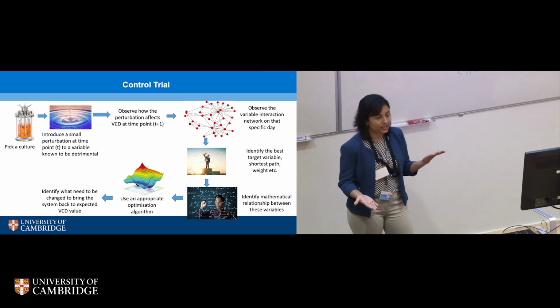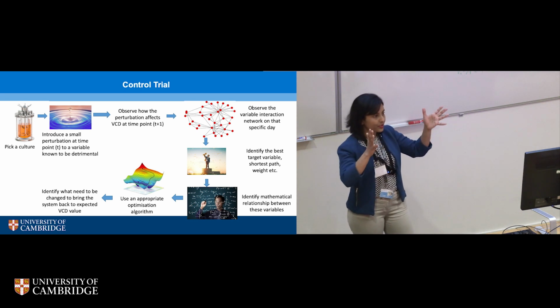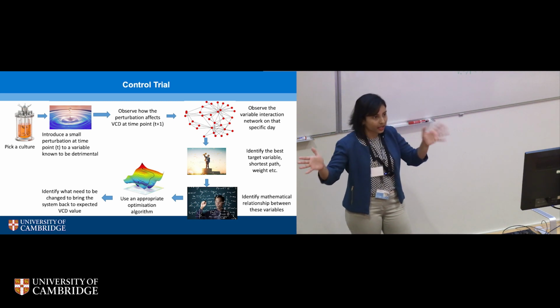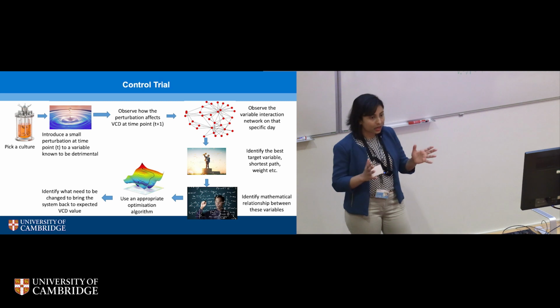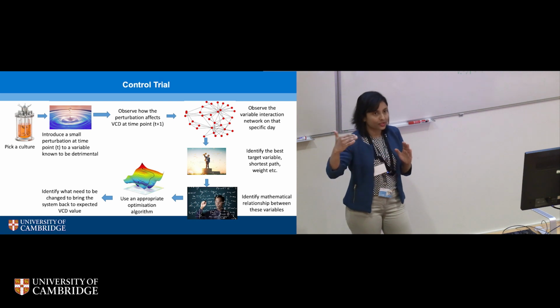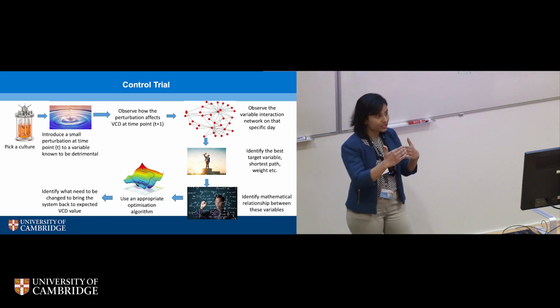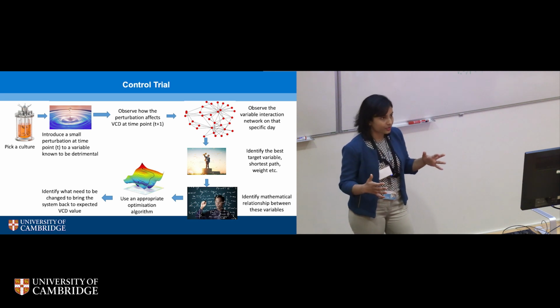And this is a powerful thing to have, because previously, all we had was a bioreactor running on its own. We didn't know what's happening. We had to wait until the harvest day to say what the outcome would be. But now we have already modeled the system so that it will tell you what the expected trajectory is, and if it's not following the expected trajectory, it will also tell you what variable to change to stick to that trajectory, because previously none of this was possible.